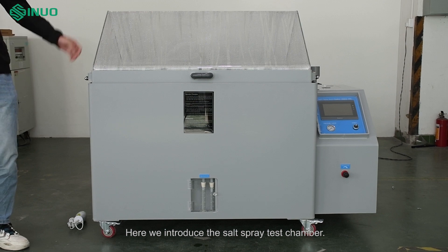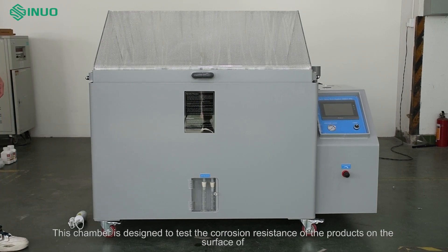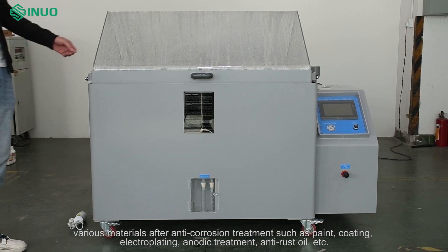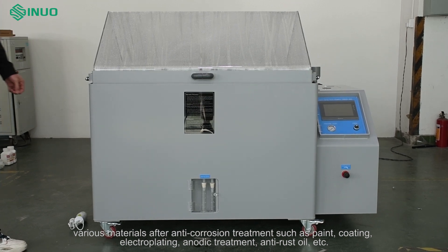Here we introduce the salt spray test chamber. This chamber is designed to test the corrosion resistance of products on the surface of various materials after anti-corrosion treatment, such as paint, coating, electroplating, anodic treatment, anti-rust oil, etc.